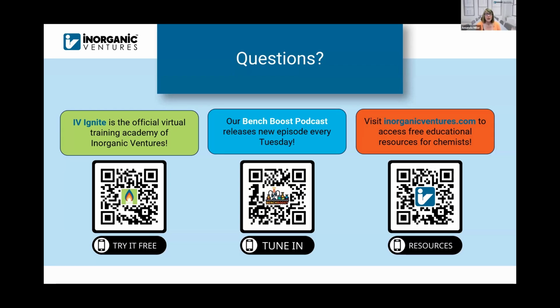Great, thank you. Next question, should the phosphate spike be added to the ascorbic acid at the same ratio as it is if making the reagent from dry ingredients? Same ratio, yes. Same exact volume that's listed in the method document. Probably not, because in the method document you're making 100 mL, and this is coming in a 125 mL bottle. So you have to do the old C1V1 equals C2V2 when you're preparing that spike. But yes, the same ratio, correct.